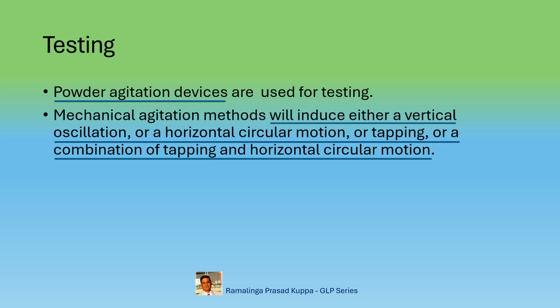There are a variety of sieve shakers like Rotap, Cole Palmer, Retsch, etc. working with this principle. There are electromagnetic sieve shakers also available with the same principle of working.